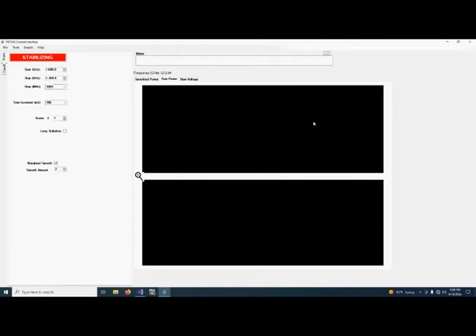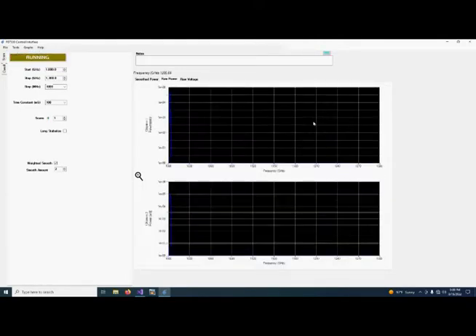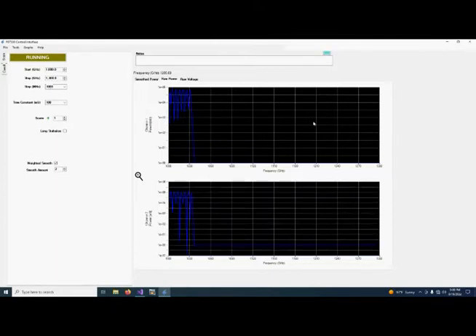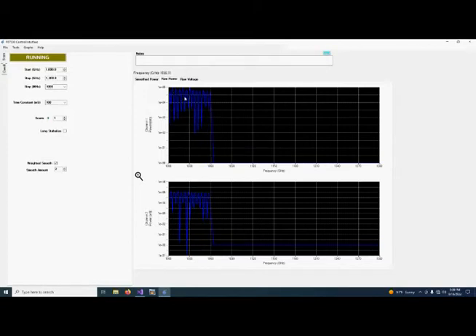In the top screen we're going to have the first harmonic. This is, if you own a basic system, this is what your output typically is. And here you can see the fringe pattern that occurs.